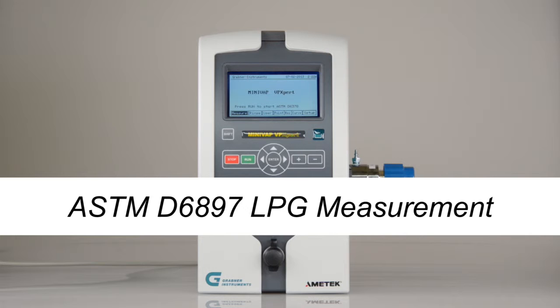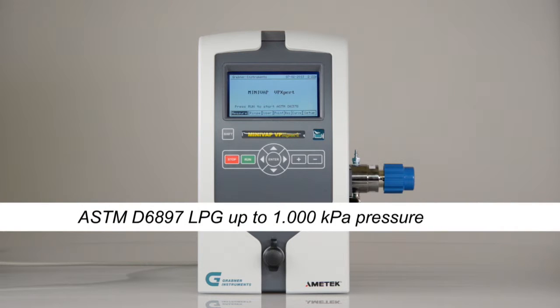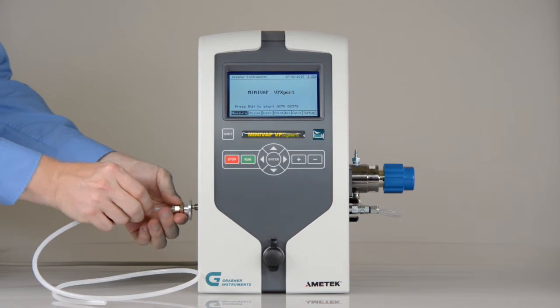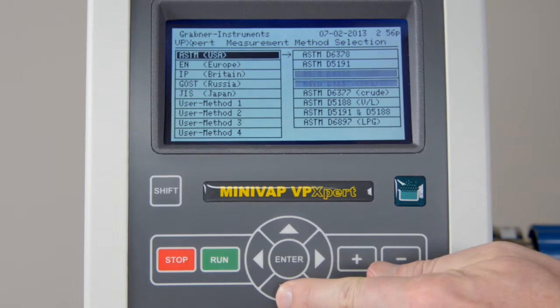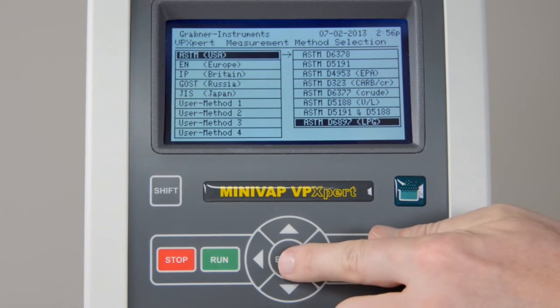ASTM D6897 LPG measurement. On the VP Expert, LPG measurements can be made up to 1,000 kPa. Before measurement, the measuring chamber is rinsed with LPG. To discard the gas, attach a polyethylene hose on the outlet side and lead it to a fume hood.